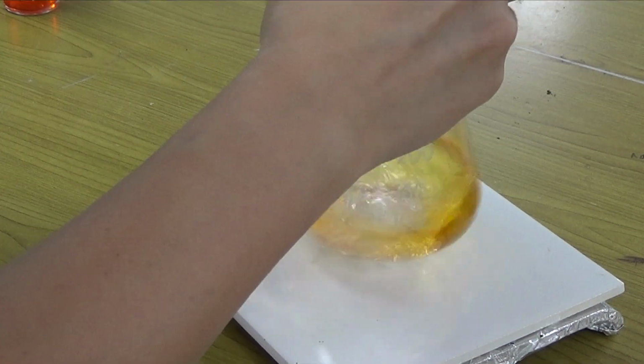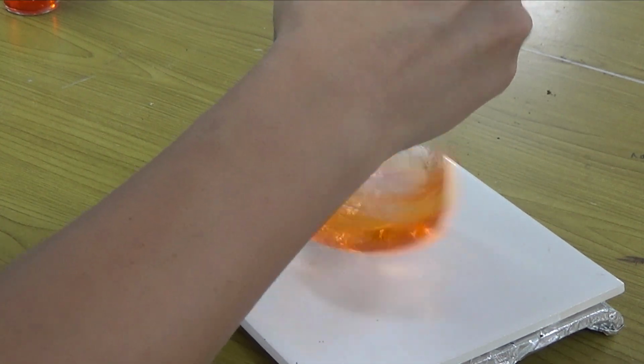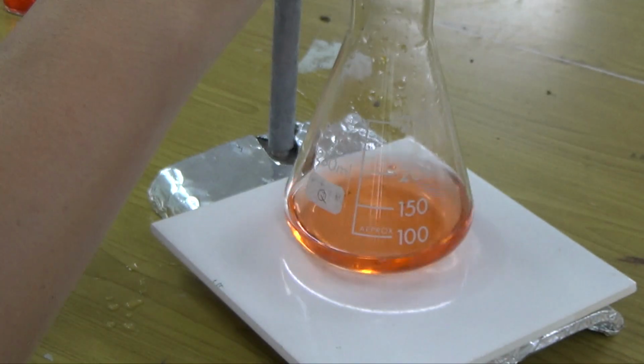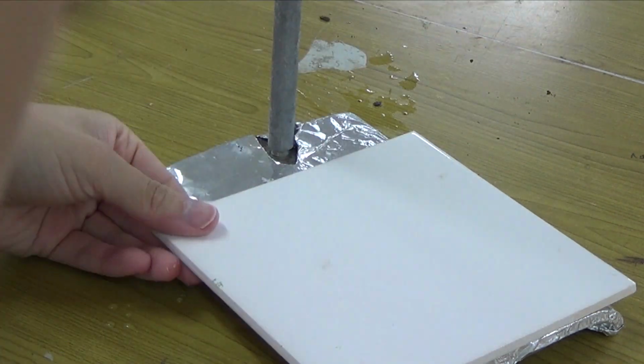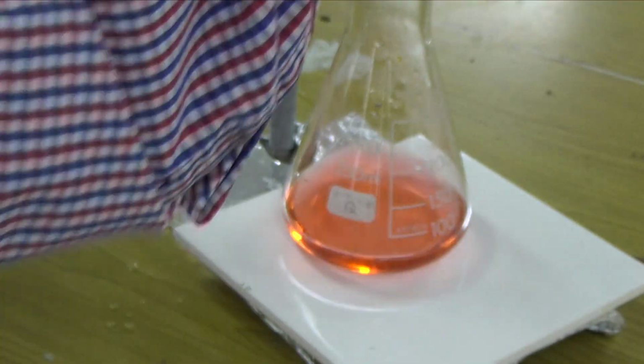I'm looking down at the white tile, and I'm pretty sure it hasn't reached the end point yet, so it's slowly turning, slowly getting there. I think it is more orangey, so this is probably it just reaching the end point just now. Okay, but of course we are not trying to be exact here, we're just doing a rough titration. I'm just going to add a bit more, and it's still a bit orangey. It's hard to tell whether this is orange or pink. Yeah, okay, not too sure how clear the color will show. But let me just read the reading first.